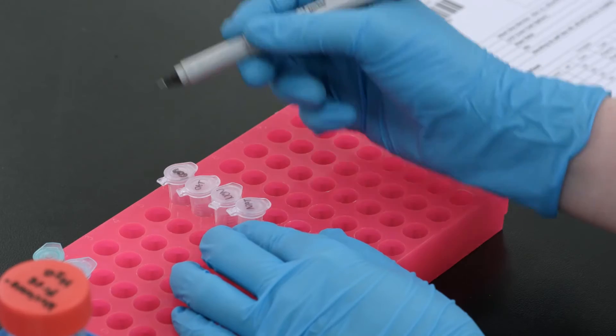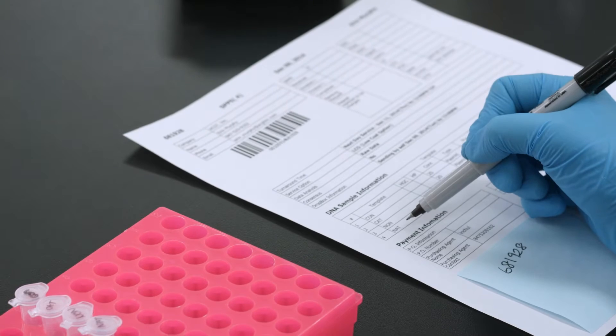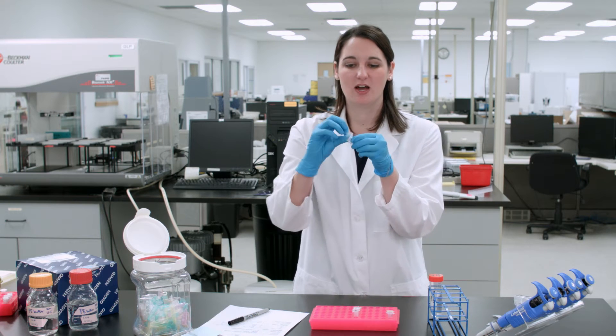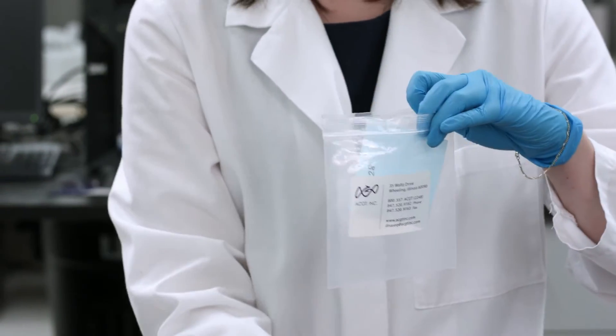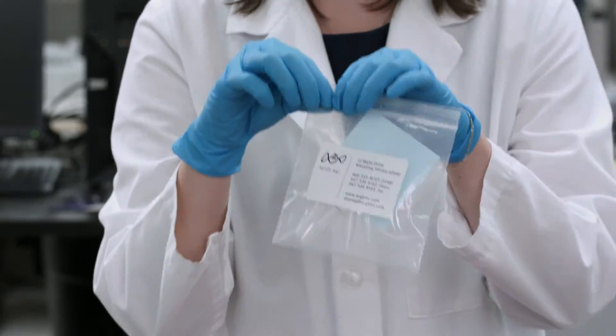Make sure the sample names on your tubes match the template names you've written on the order form. Take a small piece of parafilm and wrap it around the top of each of the tubes. Place the post-it along with your samples in one of the sample submission bags.